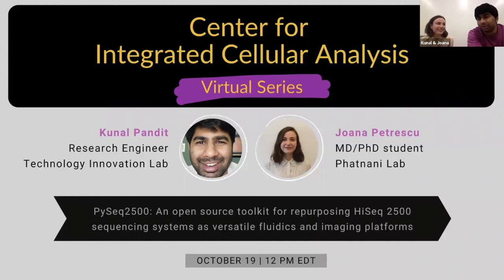Yeah, we're about to try that next. Actually, we're about to try to grow cells on our flow cell, and see if we can fix them to the flow cell and see if they stick after flowing buffer through the flow cell. Yeah, and my other question is about the ROI.